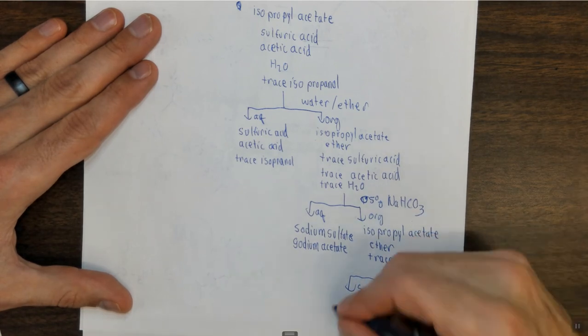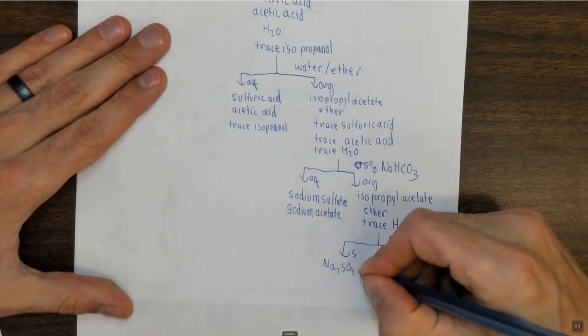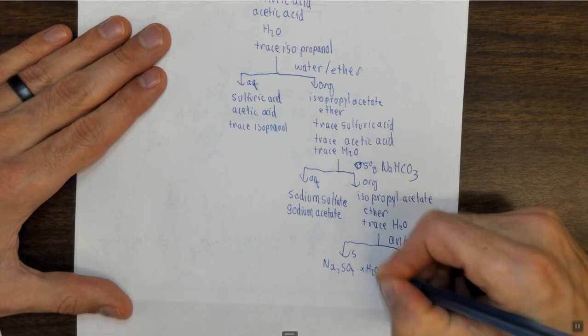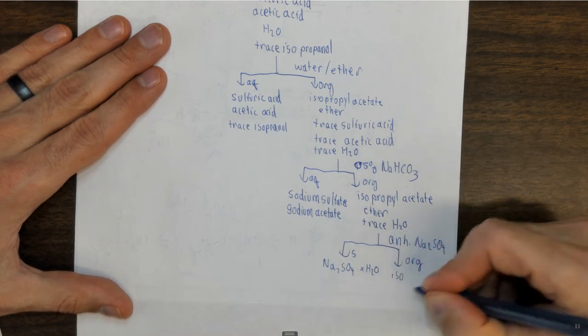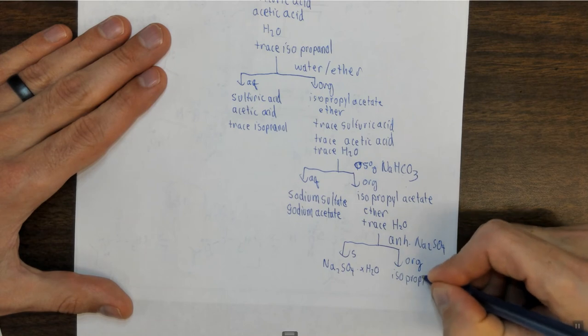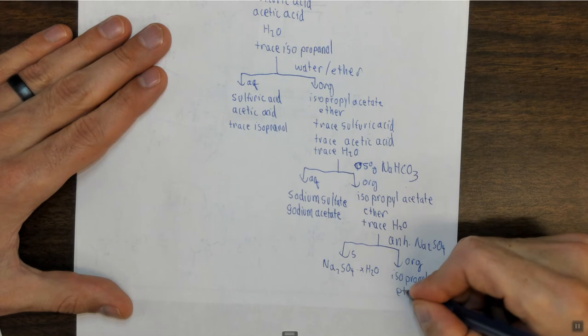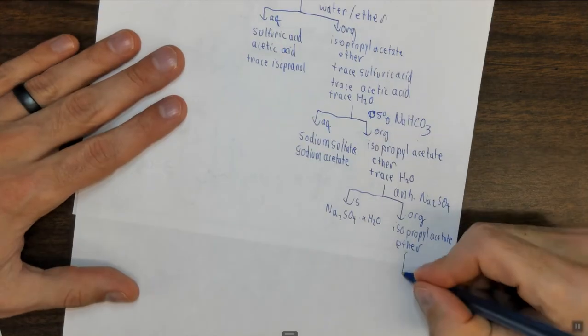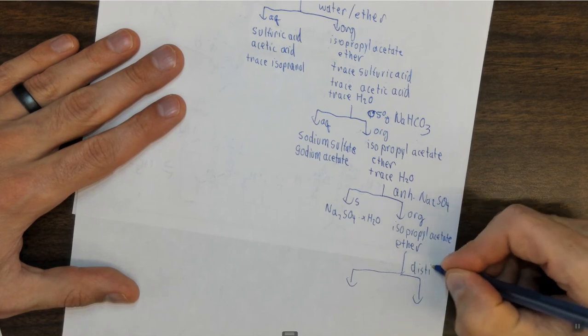And we get a solid, which is Na2SO4 and some number of water molecules. And we end up with an organic, which is going to be our isopropyl acetate and our ether. Then we're going to finally distill, and I'll talk about that more in just a minute.